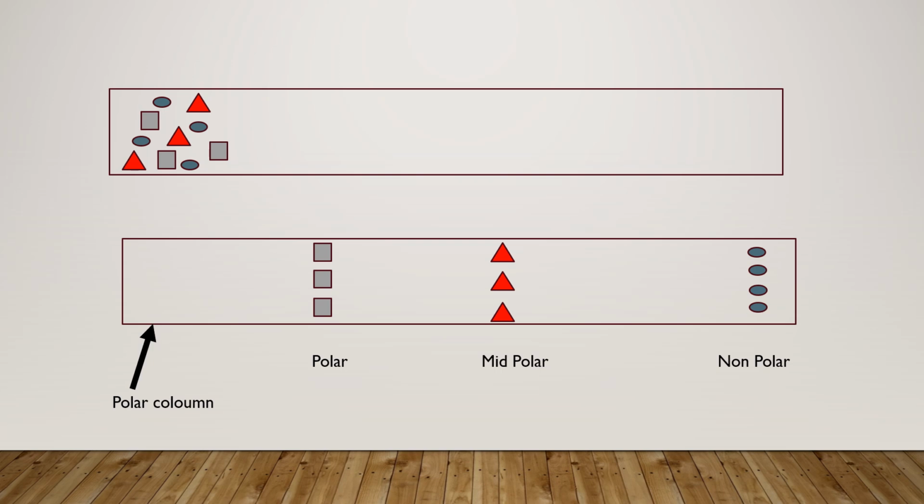And later, as the mobile phase gradient changes, the mobile phase would have more affinity towards the column, so as to replace the interaction of the polar analytes and the polar column, so that the last analyte is also eluted from the column.